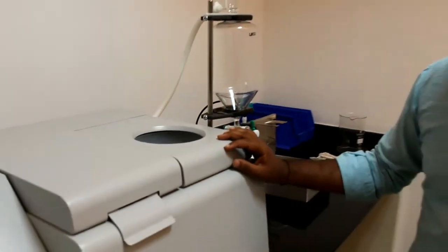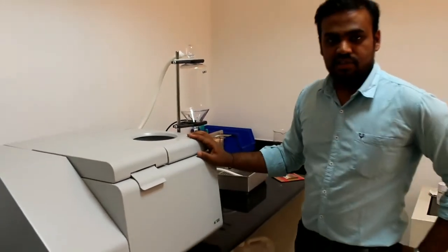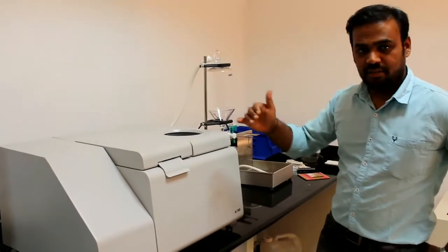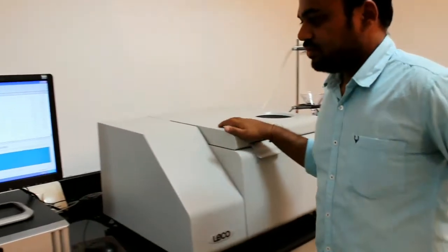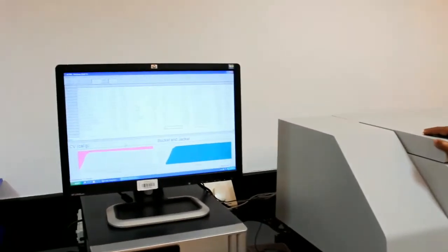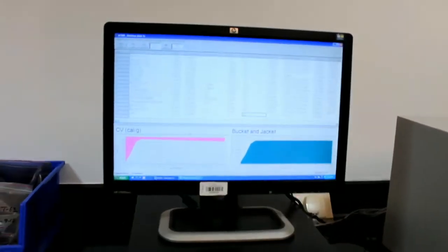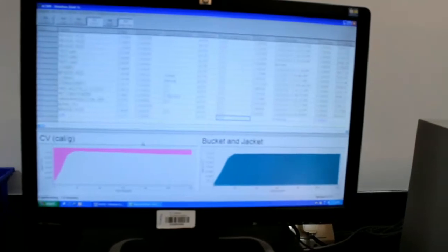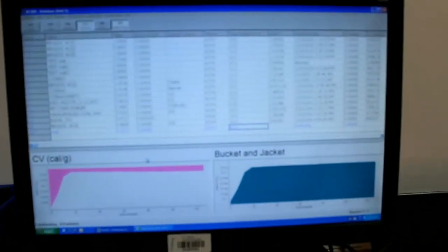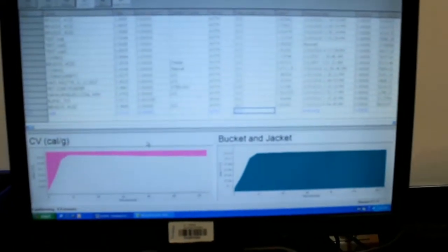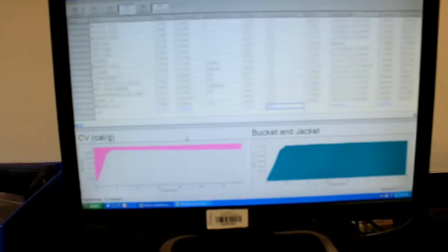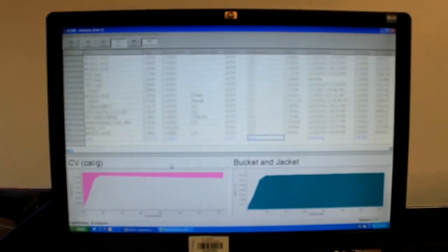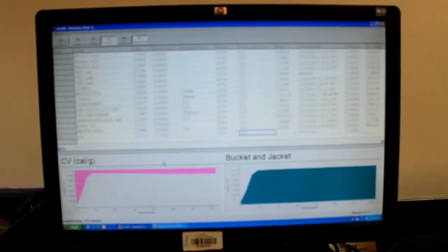It's like a radiator, it rotates its speed. Once the temperature is less, it rotates very slow. Since the temperature is high, it makes temperature low by speed of the fan is more. Still, 1.1 minutes is remaining for equilibrating.